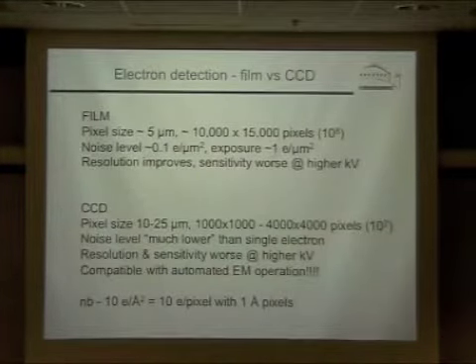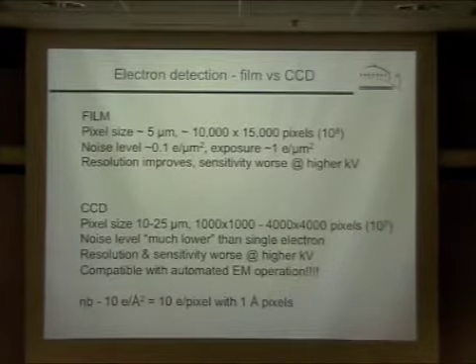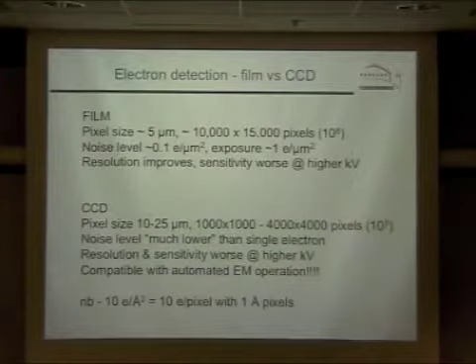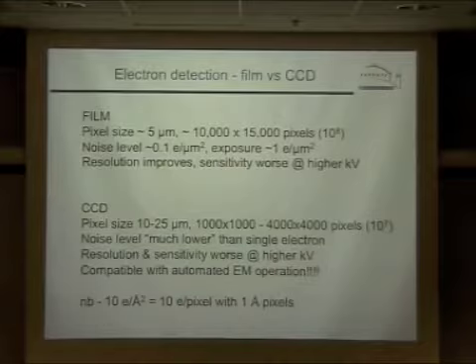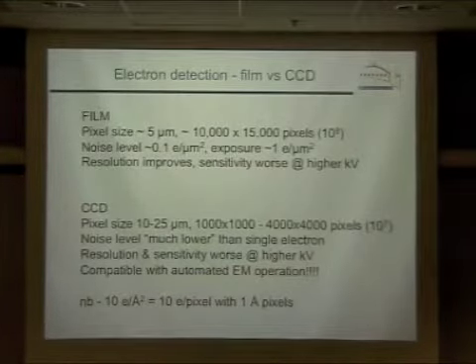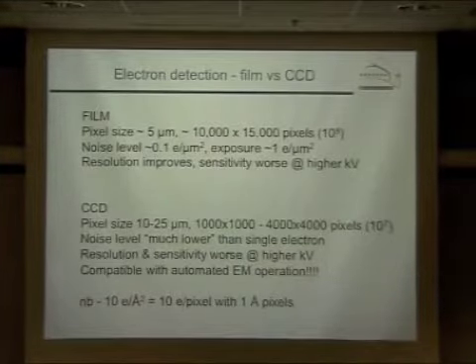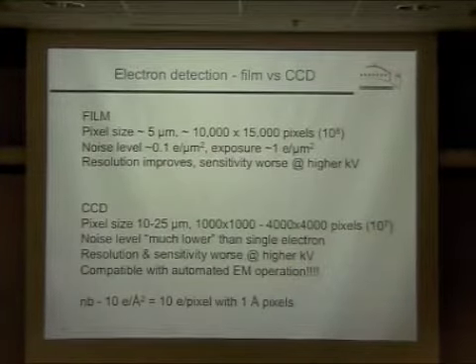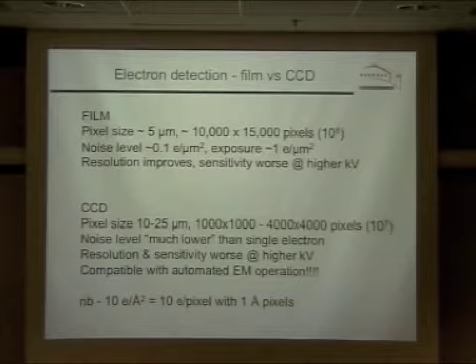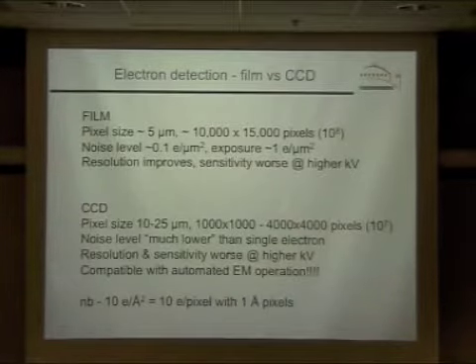So another question: the signal from the CCD is proportional to the intensity of the beam, which is proportional to the protein density, roughly, of the sample. And on film, the optical density is proportional to the intensity of the beam. Right. But what the scanner gives you is a transmission, most scanners. That's right. So you should convert the transmission to optical density. What happens if you don't? If you just take your TIFF image and start processing, you get wrong amplitudes. Yeah, because this logarithm is missing.